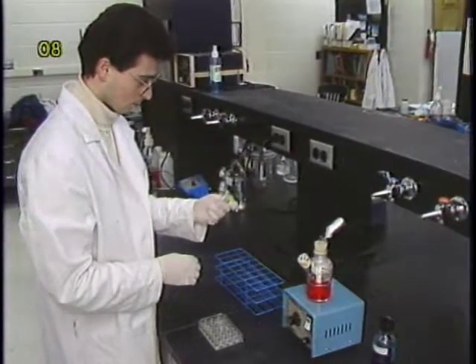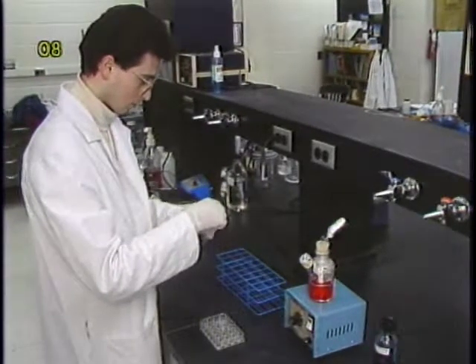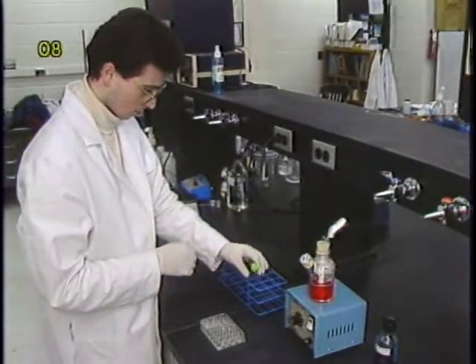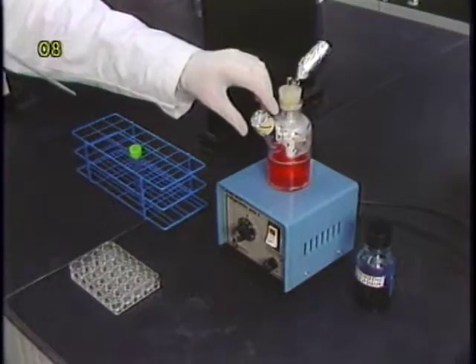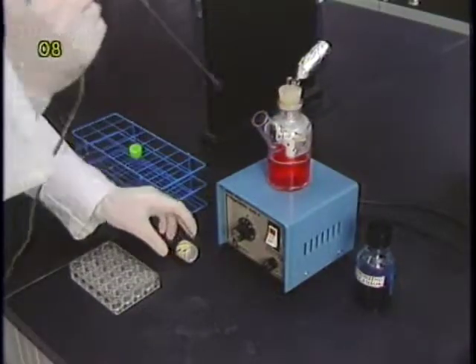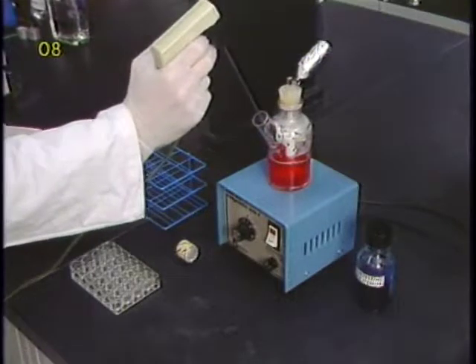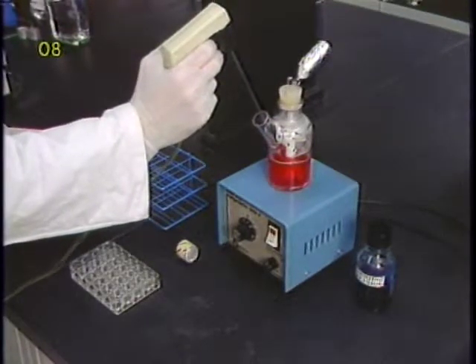The cell concentration in the microcarrier is typically measured by counting the nuclei. Before the sample is withdrawn from the spinner culture, make sure that the culture is well mixed. Usually one to two milliliters of sample are sufficient for the cell counting.